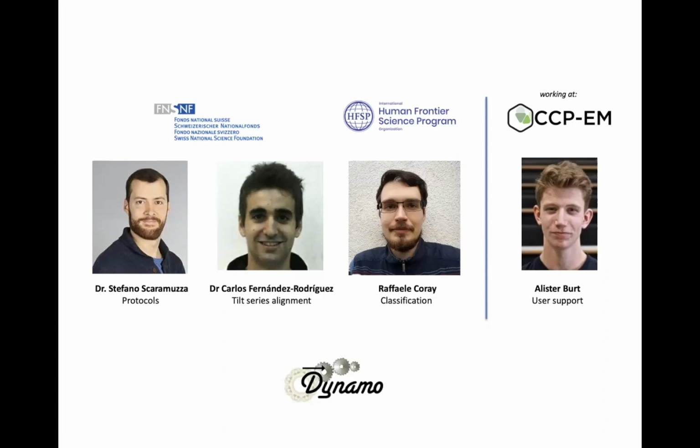We have to implement it because the next step of tomography is going totally cellular, from my point of view. Actually, that is the edge that tomography is contributing in the cryoEM family. We can see cells. So if you want to do that, the popular option is the cryo-FIB. And when you do FIB milling, you don't have markers. So I think the markerless alignment is going to take more and more importance in the next years.